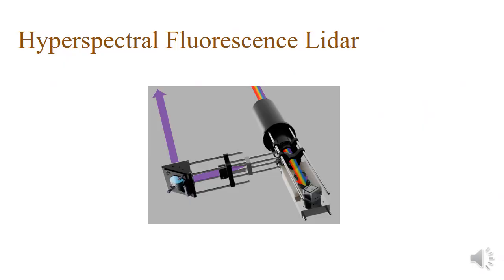This part will focus on a hyperspectral fluorescence LiDAR. Currently, there are two copies of the instrument. One is in Ghana and one is in Sweden. It's also a low-cost instrument, costing around 6,000 euros or 60,000 cedis.